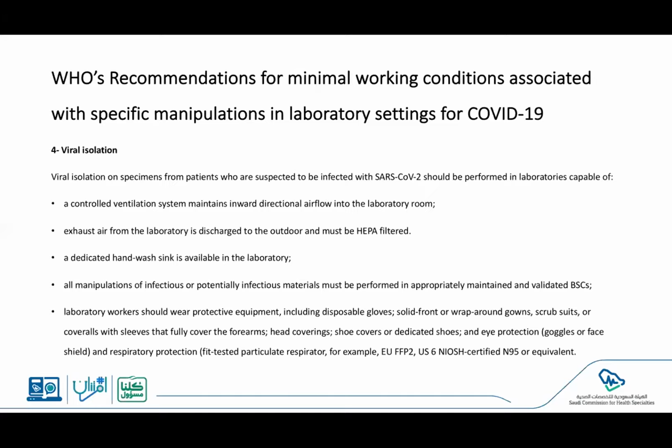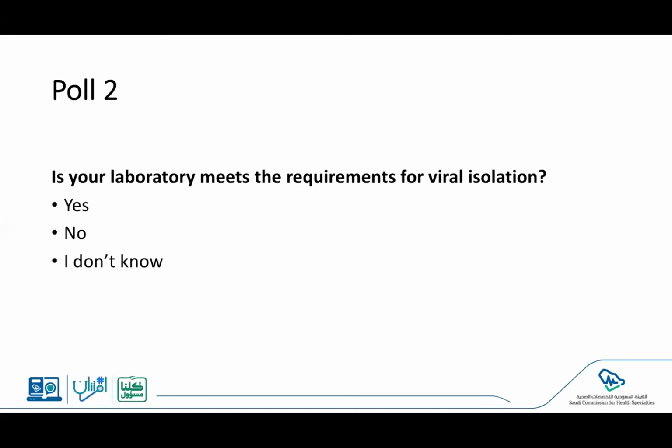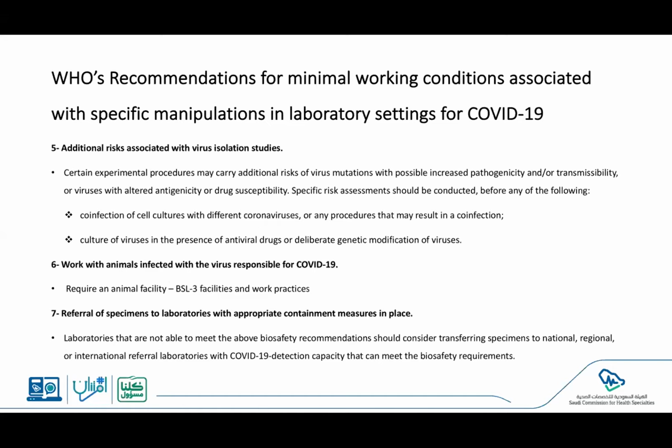I don't think we have enough time to go through the poll, but I wanted to test if you would use any negative pressure. And lastly, this is probably not applicable to the majority of us attending this session, but if you would consider, for example, culturing the virus or testing the virus on antiviral drugs, a separate risk assessment needs to be considered, and the recommendation so far is to conduct it under biosafety level 3.